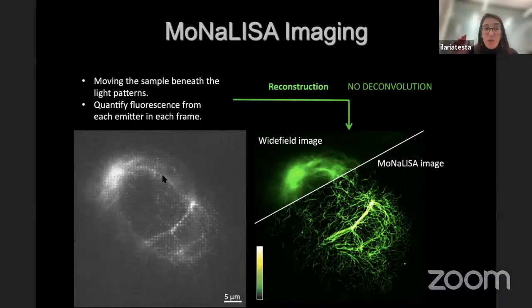If you want, you can also apply on the very same data the algorithm that they use for nonlinear structured illumination, and probably you get some information here and there. But you also have to keep in mind that you need to know exactly where the pattern is, and you are putting some prior information on the type of point spread function you are using. I always like to do it, because especially now we know the power of image analysis and what you can reach with that, but I think it's still very good to have the raw data as validation.